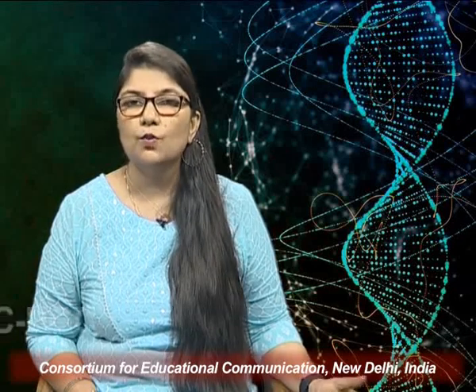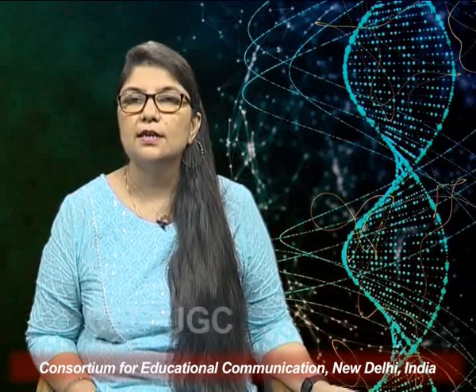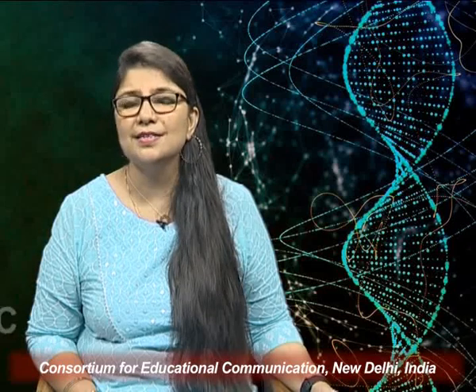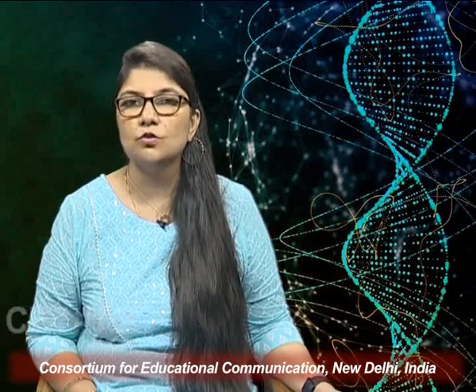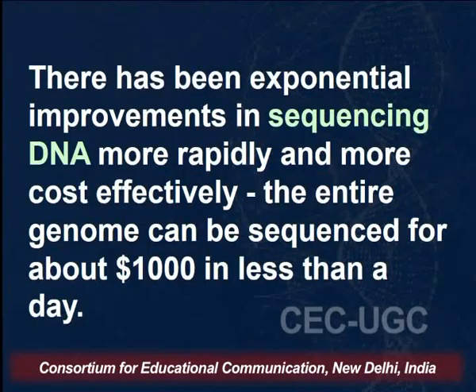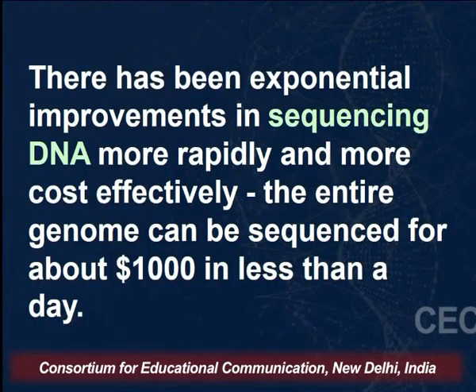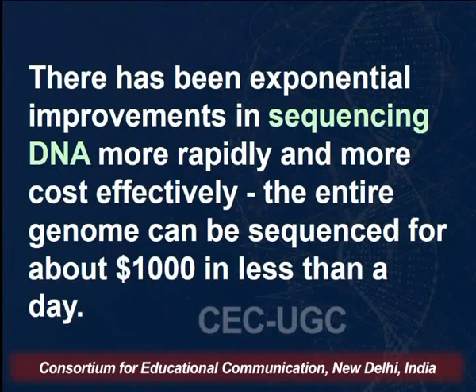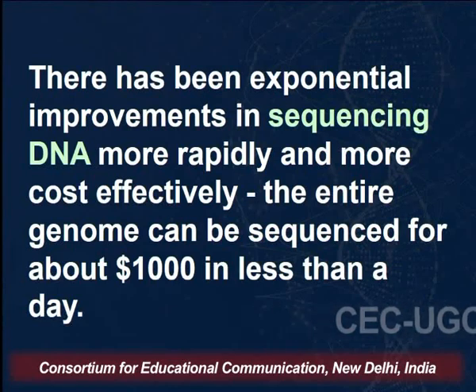So, if we want to analyze it for further studies, we need to determine the exact sequence, and the technique that is used is termed DNA sequencing. There have been exponential improvements in DNA sequencing techniques, which are more rapid and more cost effective. The entire genome can be sequenced for about $1,000 in less than a day.